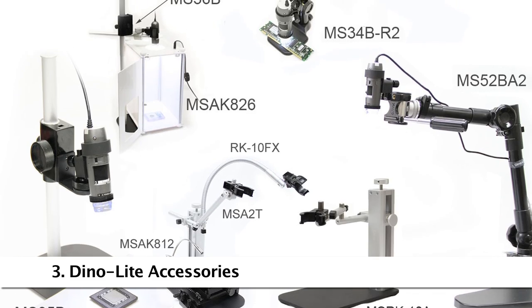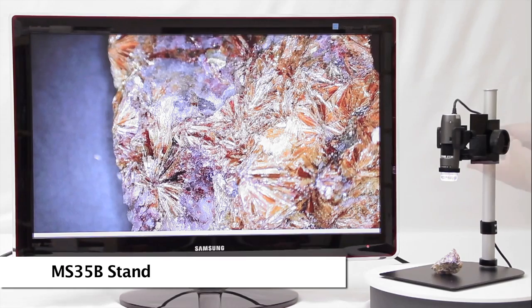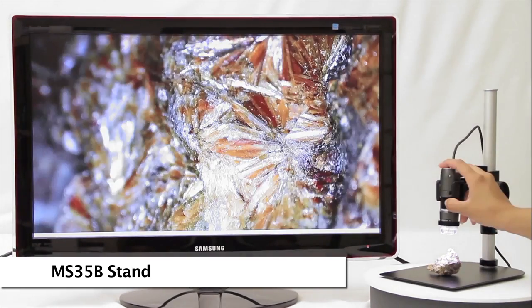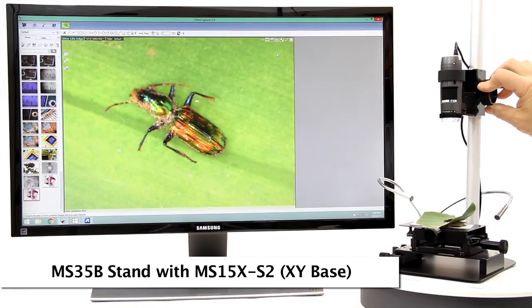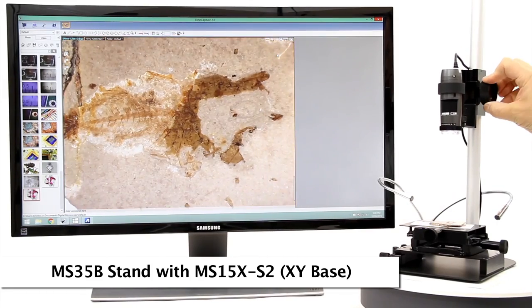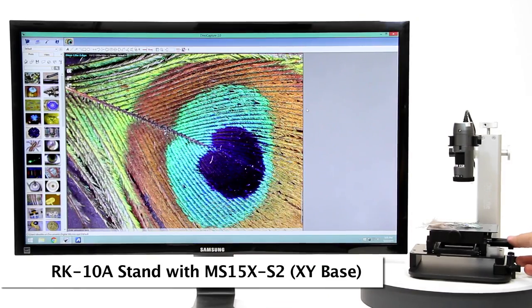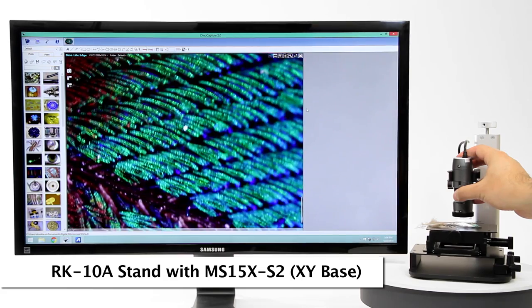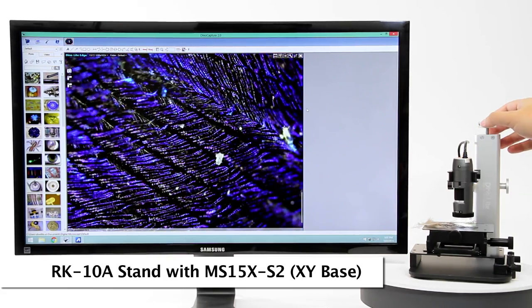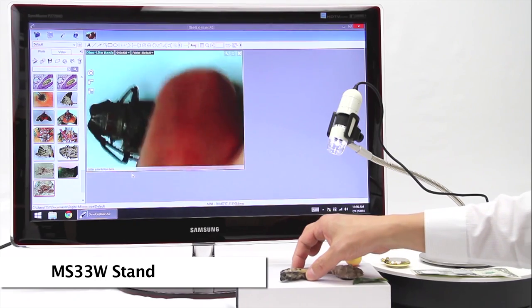Here are some compatible and recommended accessories. The MS-35B is a reliable stand with simple height adjustment and a fine adjustment knob that can be paired with the precise movement XY base. The RK-10A is a newer design of the tabletop stand with a simple height adjustment release button and fine adjustment knob on top. Other options include budget-friendly articulating arm stands like the MS-33W.